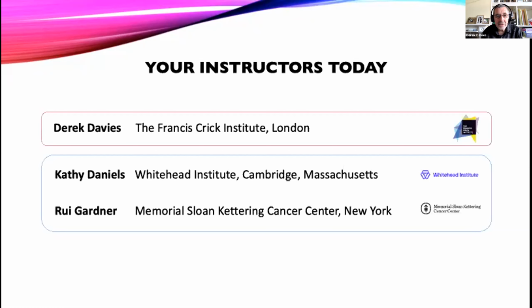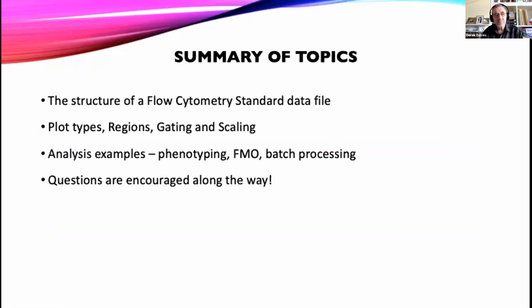So what we're going to do today is continue from last time. Last time, we looked at the basics of data analysis. This is one of the things that those of us in core facilities have to deal with quite a lot. We train people how to run an experiment. We help them with experimental design and maybe even sourcing reagents and sample prep. But quite often we let them go off with their data to play with it. They should come back to us, but they don't always do that, and sometimes people don't develop the level of confidence that we'd like them to. So one of the things we wanted to address with some of these webinars was to give you confidence in the basics of data analysis.